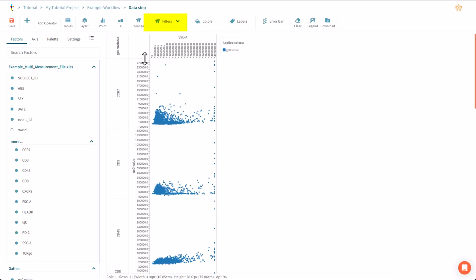Filters are a way of narrowing down the data projected by the crosstab grid. Use them to control what is shown in a graph or sent to an operator for calculation. In Tercen, a filter is a list of rules built up in the settings. Each rule has three parts: the factor it's based on, logic for the rule to use, and a piece of data to define the rule.